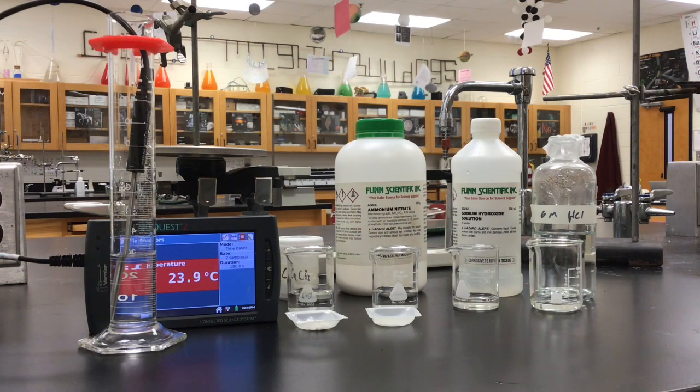Before we do that, though, it's important to recognize two terms that are very important when discussing endo or exothermic, and they are system versus surroundings. You can't see the system here because the system is each set of individual molecules. They're too small to see. So what we measure today will be the water, which doesn't participate in the reaction, and so it is the surroundings.